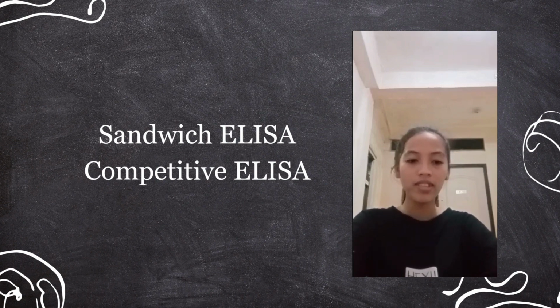The intensity of the signal is directly proportional to the amount of the target protein or antigen present in the sample. So sandwich ELISA is commonly used in research and diagnostic laboratories for the detection and quantification of various proteins, including cytokines, growth factors, hormones, and viral antigens. It offers high specificity and sensitivity, allowing accurate measurements of protein concentration in biological samples.